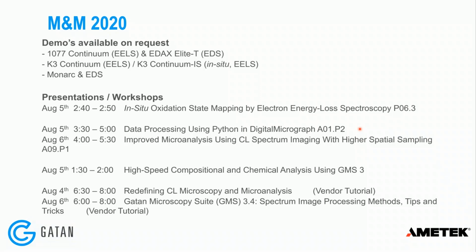So the omega Q setup on the standard camera is we changed the optics of the system so that the spectrum height is made a lot taller, basically more pixels. Our spectrum is taller, but we don't have to make so many changes with the K3 detector because we're already in an alignment regime where we have this really high spectrum anyway. So electron optically, it's pretty much the same or similar to the standard K3 alignment.